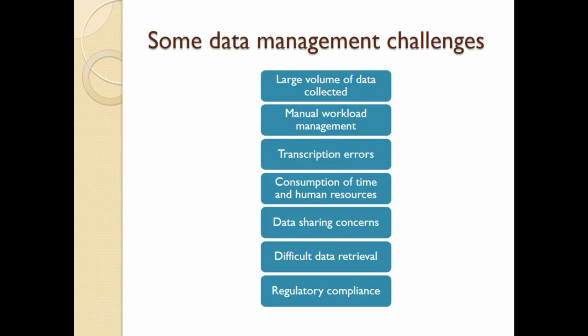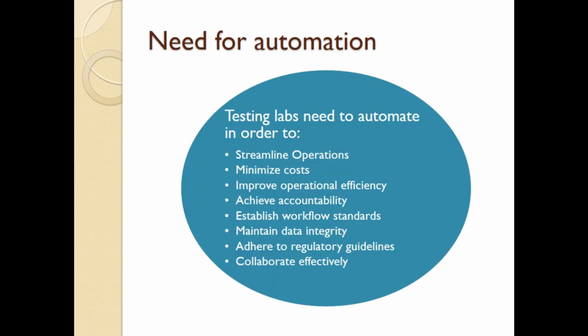Data retrieval then can become difficult because the data is spread across several different logbooks, several different instruments, maybe different analysts were involved in the assay, so it's quite difficult to pull all that information together. And obviously there's regulatory compliance issues that we need to be aware of at all times when it comes to managing your data and ensuring compliance with these procedures.